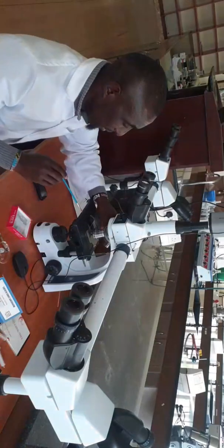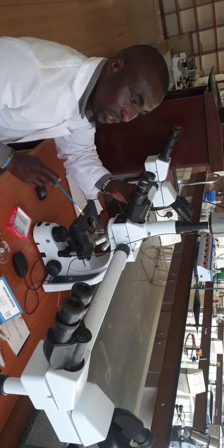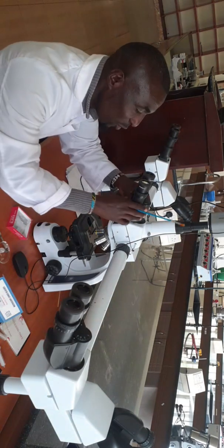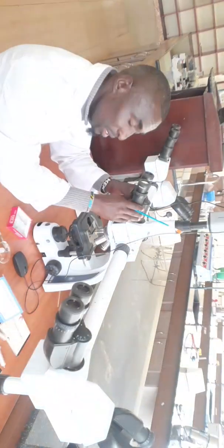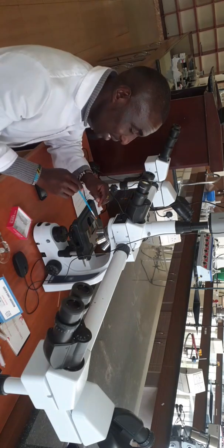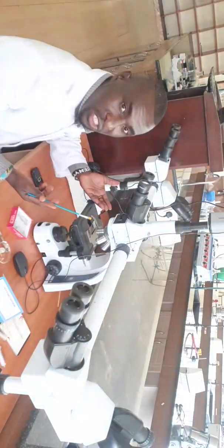Very good. Now, this is the ocular lens or the eyepiece. We call it ocular or eyepiece. The eyepiece is always times 10. So when you want to make a calculation, you work with, for example, times 4 objective times 10 eyepiece. The magnification will be times 40. That's the total magnification.